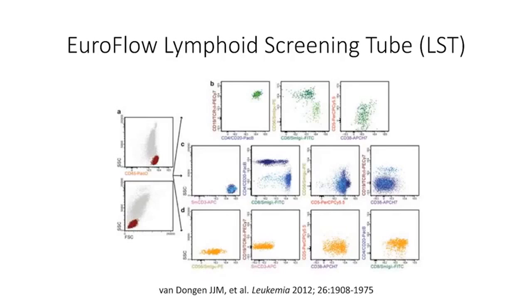We talked about this approach, though, of using more than one antibody per channel, and as a group we were uncomfortable with doing that because it's quite common, of course, in lymphoid and hematopoietic neoplasia to see aberrant antigen expression, and that can be novel antigens that you don't expect on a given population. It could be loss of an antigen that you do expect. So if you can envision a T-cell lymphoma, for example, in which surface membrane CD3 has been lost, this algorithm would become difficult to interpret.